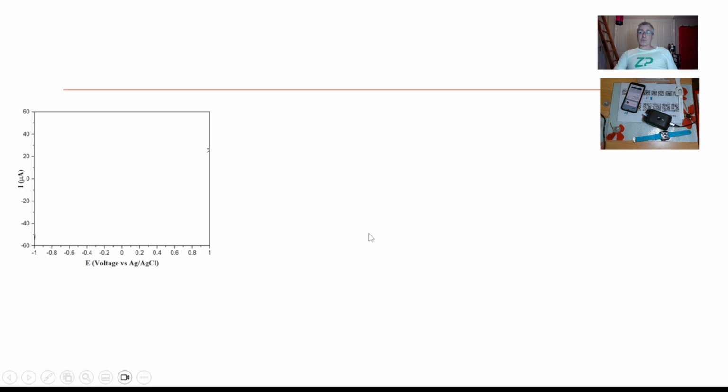If I was doing this experiment, what I'd be doing is first of all recording the background. So I would just be running this in buffer.